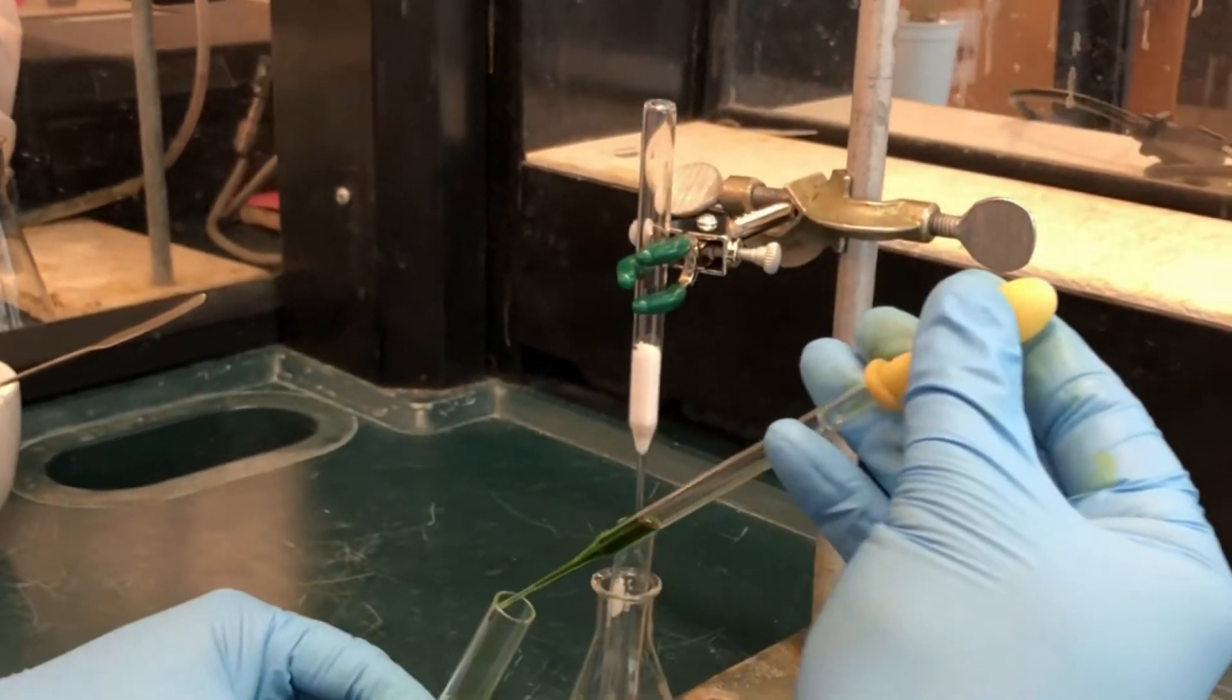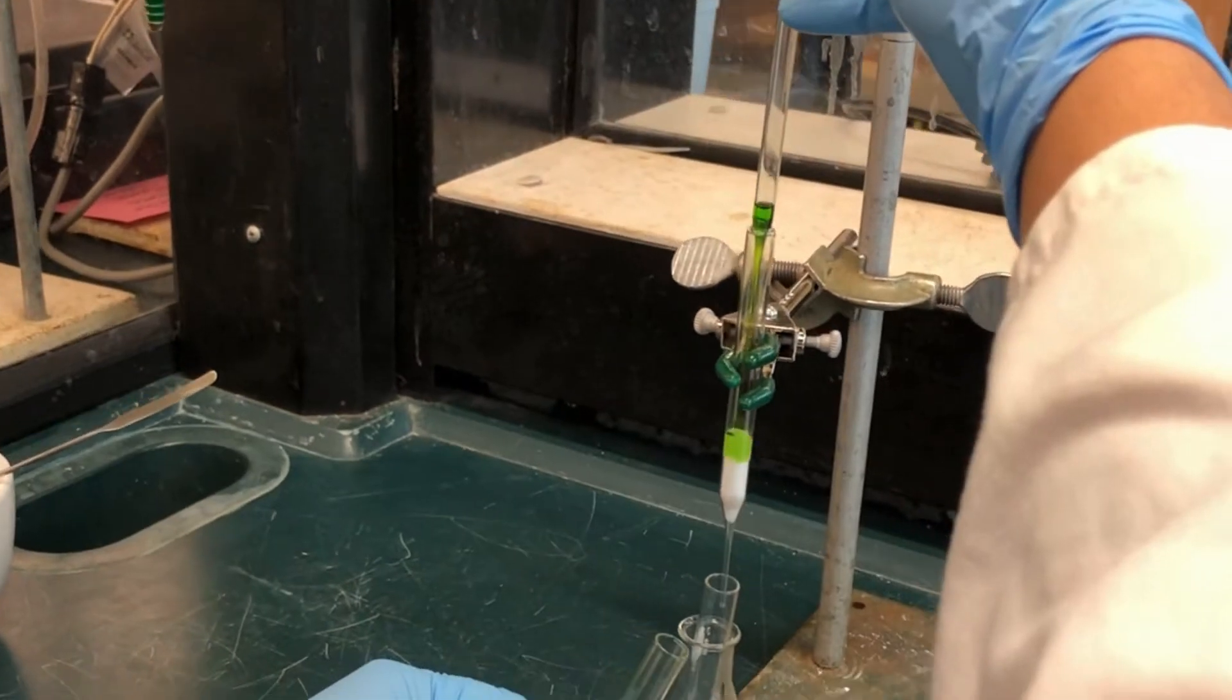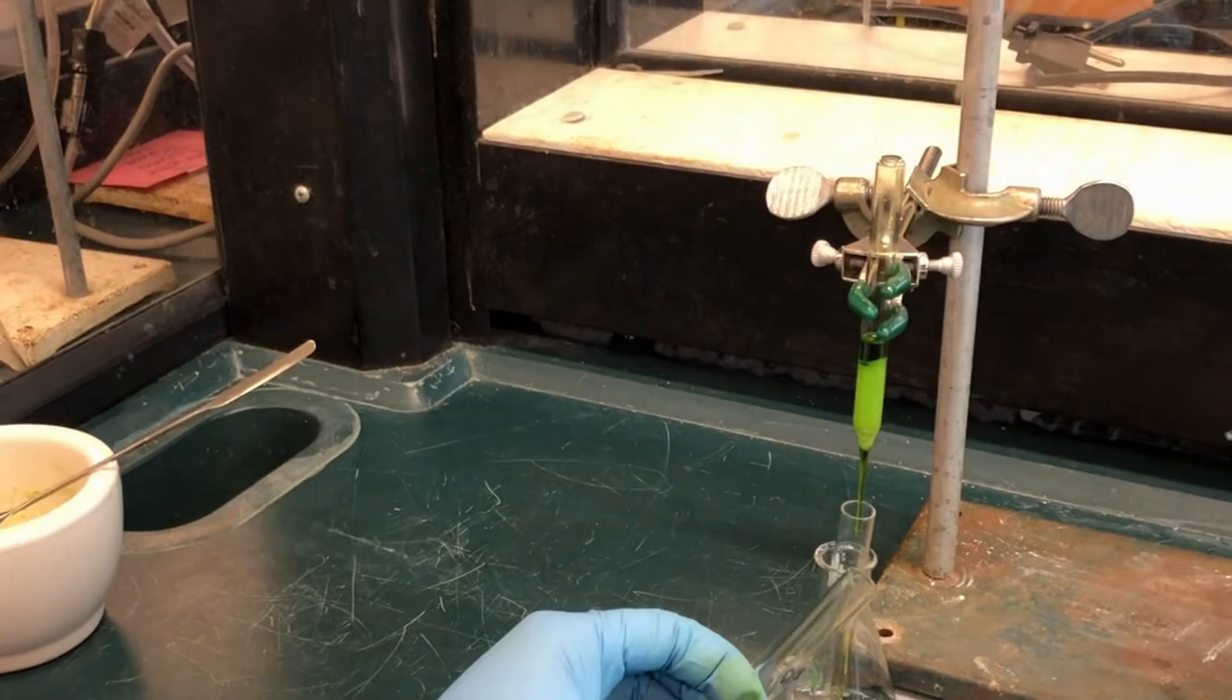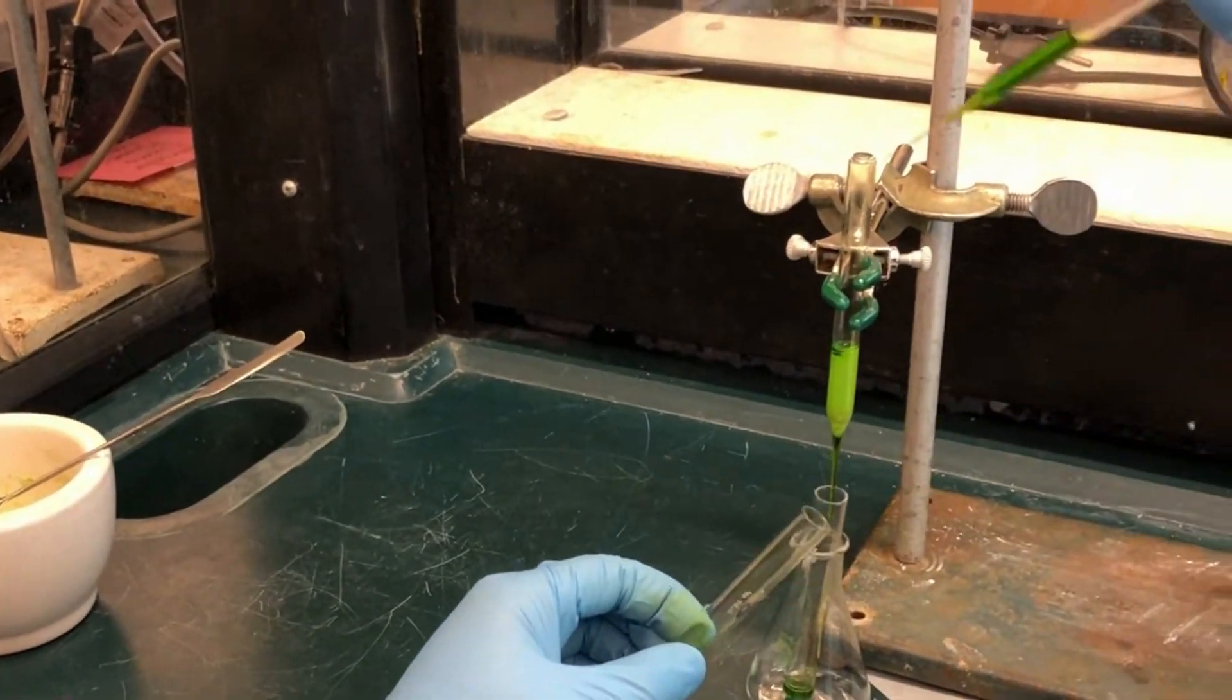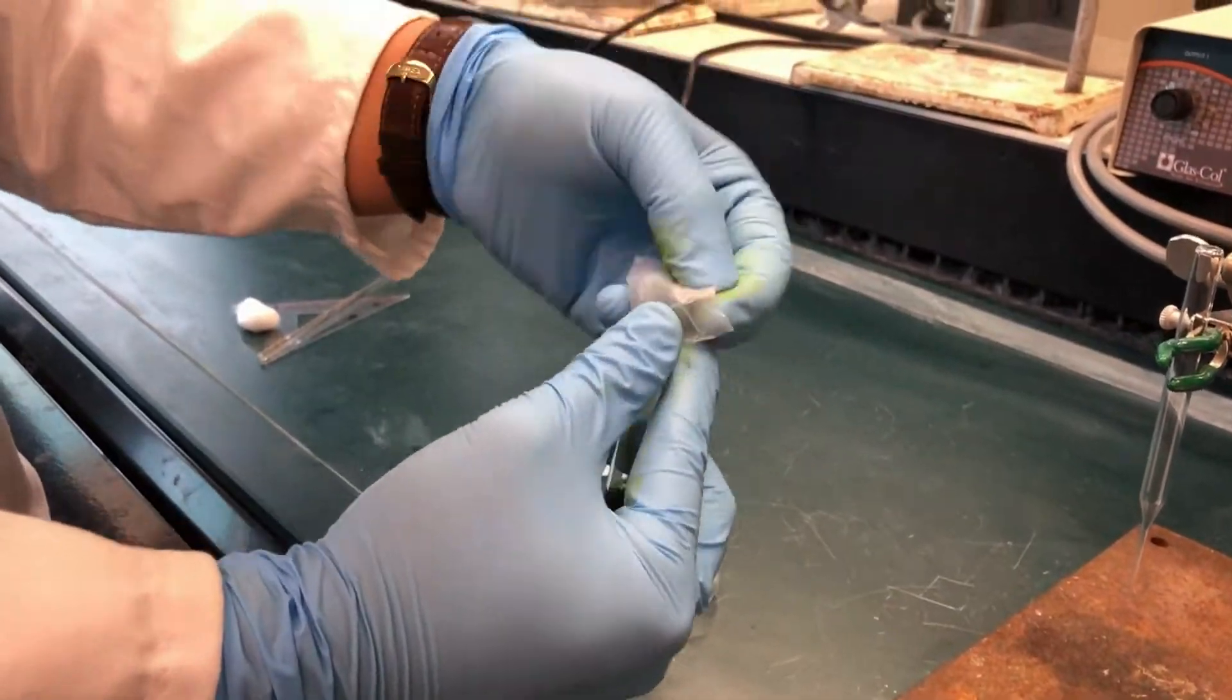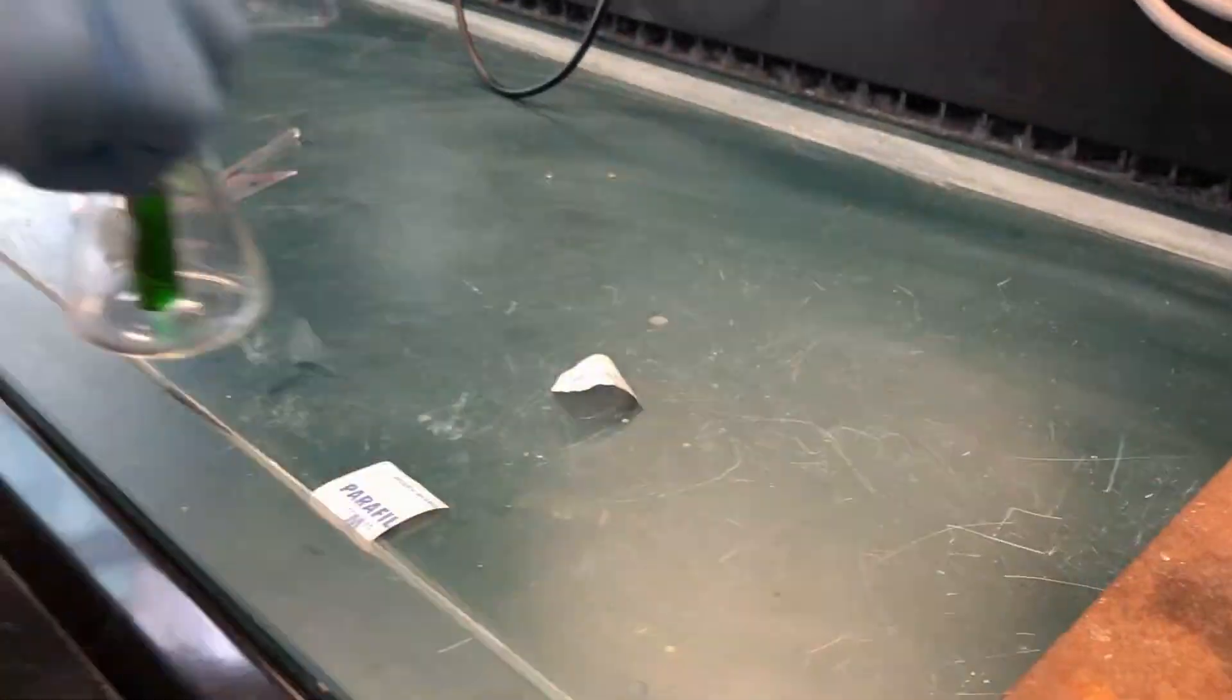Put a small test tube under the drying column. Carefully pipette the green petroleum ether layer into the top of the drying column and let it run through the sodium sulfate into the collection tube. Cover the collection tube with parafilm and leave it in your drawer over the weekend to dry.